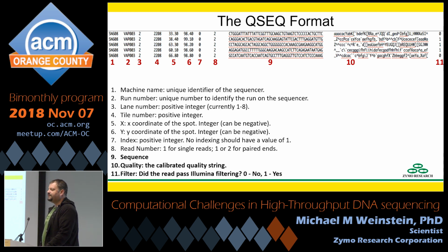And a Phred score is sort of an exponential score for confidence. Typically goes 0 through 40 for raw sequence, with 0 representing essentially 0 confidence. It wouldn't have even called a base there. A Phred score of 10, 90% confident. Phred score of 20, 99%. 30, 99.9. And 40, 99.99. So a Phred score, I never actually calculate them out. I just generally go by kind of those guidelines. So for example, if I see something got a score of 30, I know the machine thinks that there was about a 1 in 1,000 chance that it made a mistake on it.